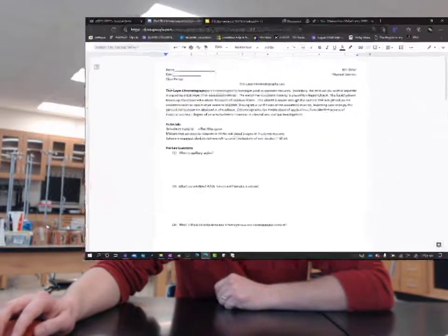We'll also have a stopwatch running, and we'll probably just put a digital one on the screen. Once we start our experiment, we'll take note of times at which we notice certain things happening, which you'll diagram and describe in your lab guide. What you're turning in for this lab is just the completed lab guide. Let's take a look at it for a moment here.